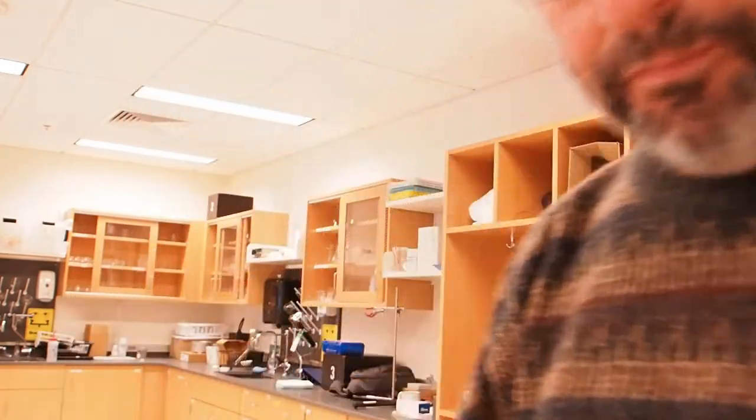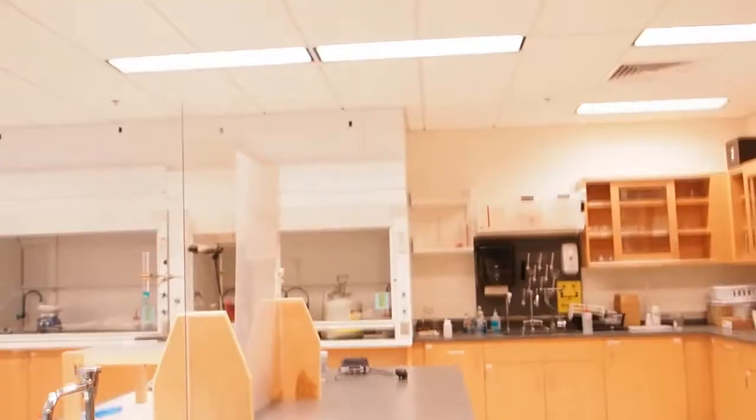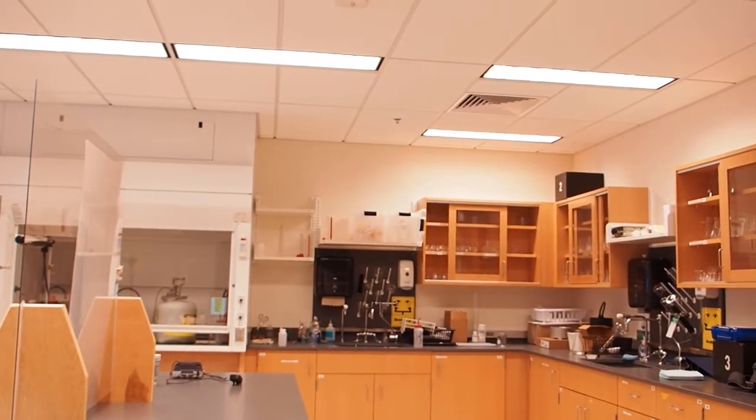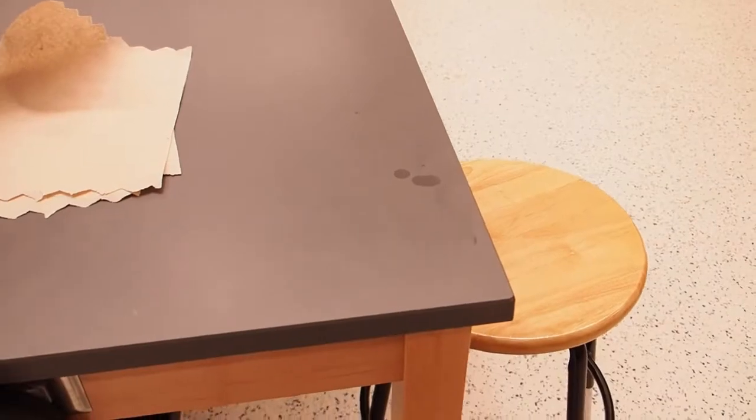When you go to your lab bench, the first thing you need to do is to assume that there's stuff on your lab bench that's bad for you. And so I just came in this room now to do this filming, and I just want to show you something. So right here on this bench is this spot. Look at that. If I move the camera around a bit, it's shiny. There's a shiny spot on the bench. So you can see the light shining off it. So it looks like it's wet, but it's actually kind of not wet.